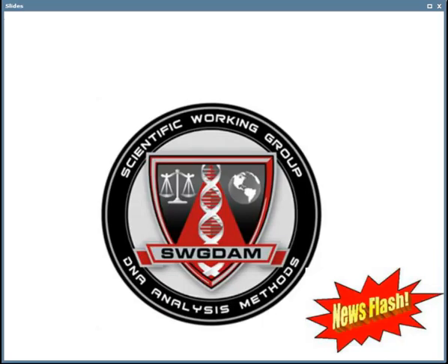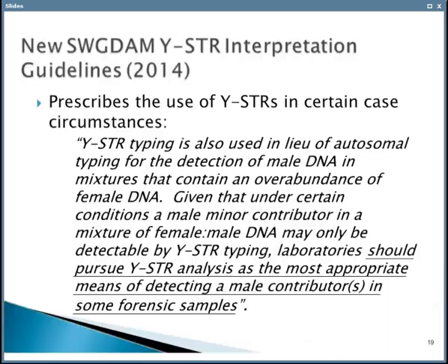So firstly, however, I'd like to mention that SWGDAM, in its infinite wisdom, is coming out with a new set of y-STR guidelines. And my talk will talk about y-STRs to a large degree. And I just wanted to mention what these guidelines are going to say. I realize that many of the participants are not in the US, but I think that it would be fair to say that SWGDAM guidelines are still of interest to other people, wherever you are. Anyway, the new SWGDAM guidelines are going to prescribe the use of y-STRs in certain case circumstances. We're taking a proactive stance and saying that labs should pursue y-STR analysis as the most appropriate means of detecting a male contributor in some forensic samples. In some forensic samples, that's what you should be doing.